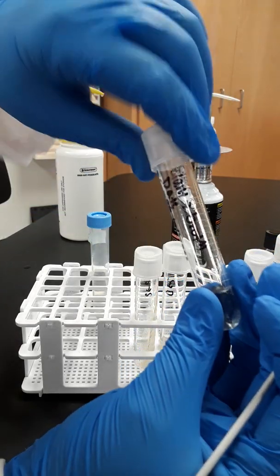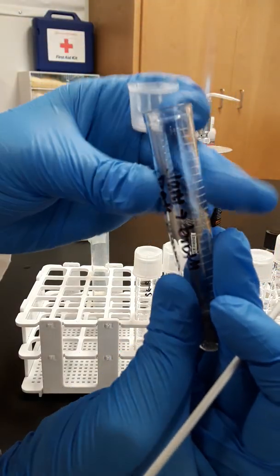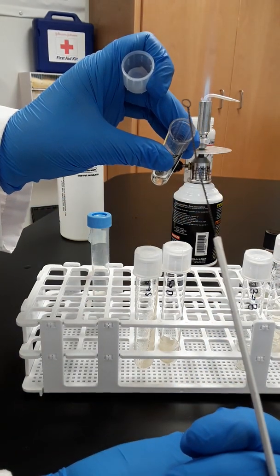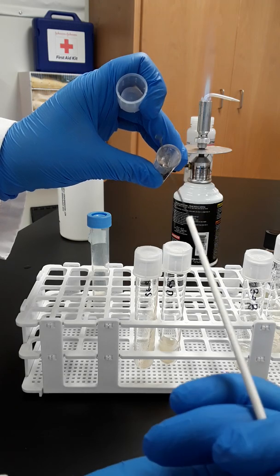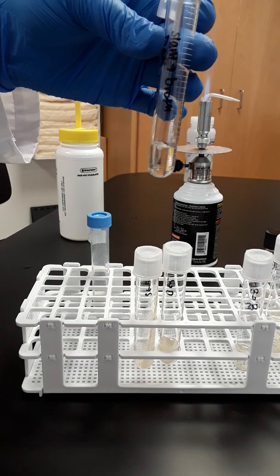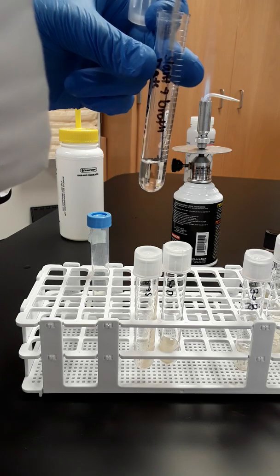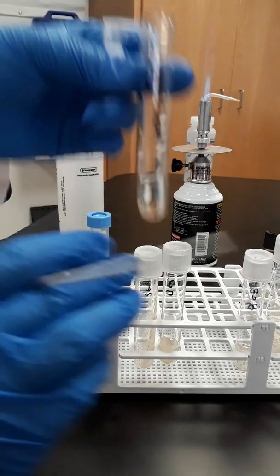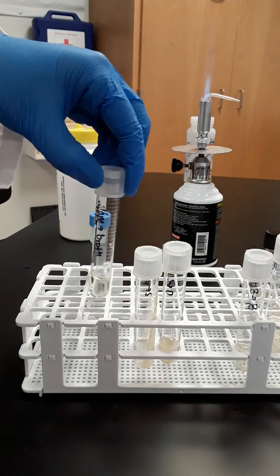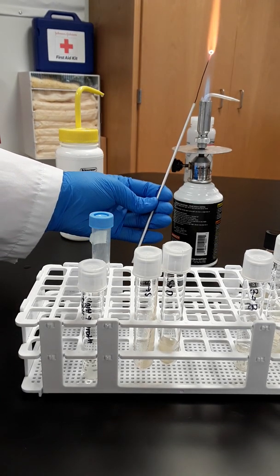And then we're going to open our first transfer, which is slant to broth. So we are taking it from a slant, putting it in broth, and again, you're going to hold the cap off on the side. This you are not going to sterilize in between, because this has a cell on it. We want to get that cell into here. You're going to insert without touching the sides as much as possible, and you're going to twirl, twirl, twirl with your fingers, just like that. And we have now transferred that cell into this broth. Flame, flame, flame, cap it. And done.